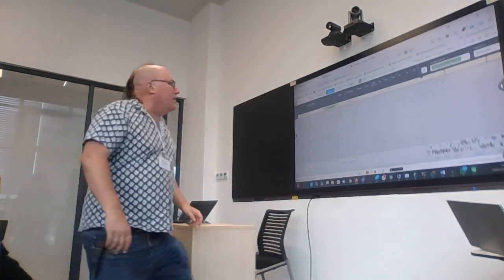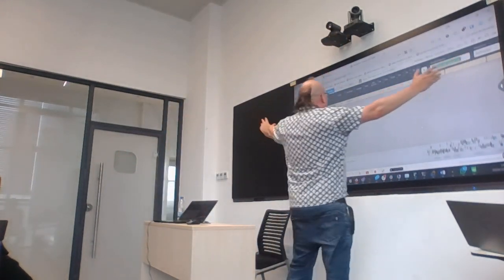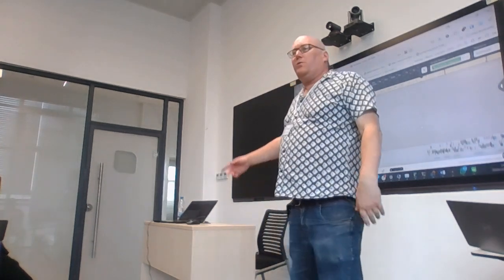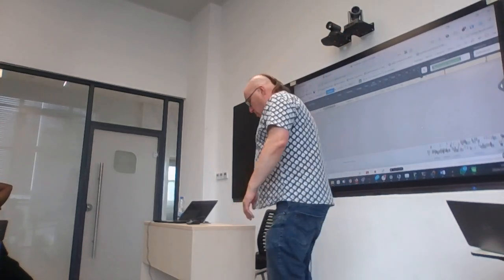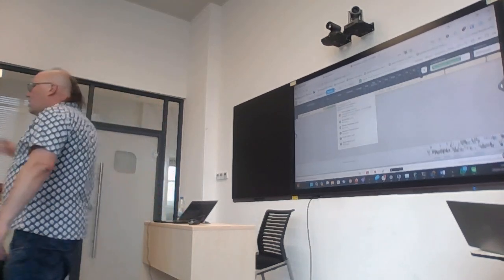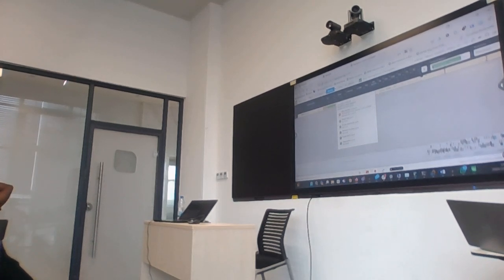So what do we see here? Let's look at the screen. This side is the quality control metrics. If you've used Nextclade before, you've seen this before. Okay. And let's go through them one by one. N: how much of the data is missing? Now, we would love to get 100% of the genome.